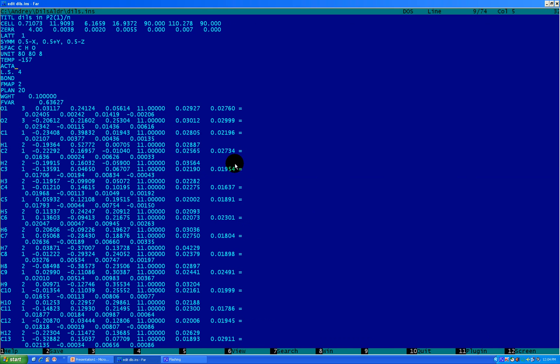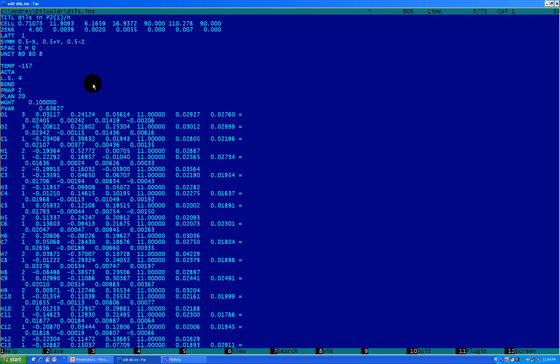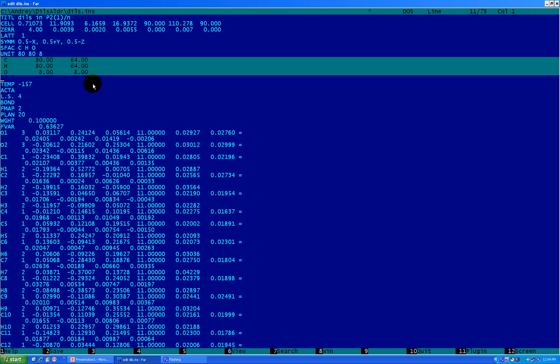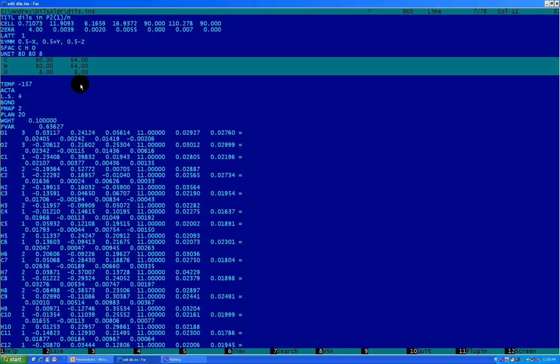Escape and go to your INS file. Okay. You see the temp and unit commands right here. Go to the temp and create a free line with Enter. Go to the free line with the cursor and press Control V to paste. Right now you can see this table. And you can see the unit. Obviously, in this table which we just copied, the first column corresponds to values what you have in unit right now, and the second column, what it's supposed to be.